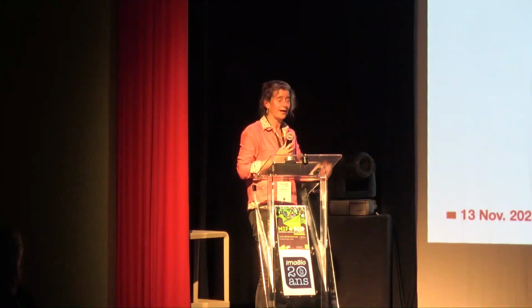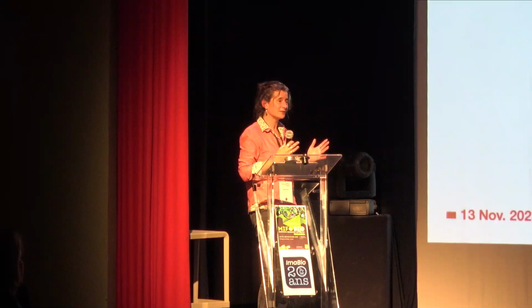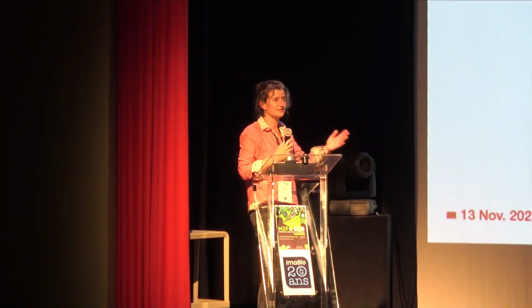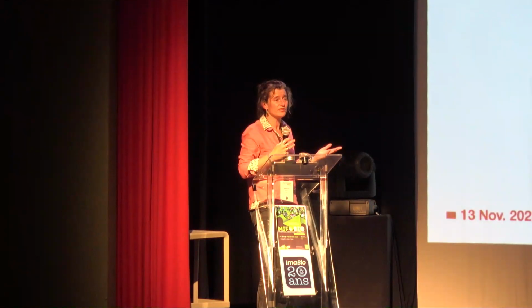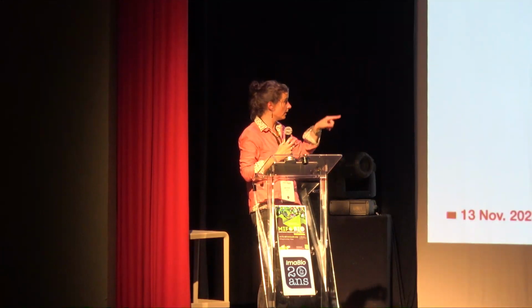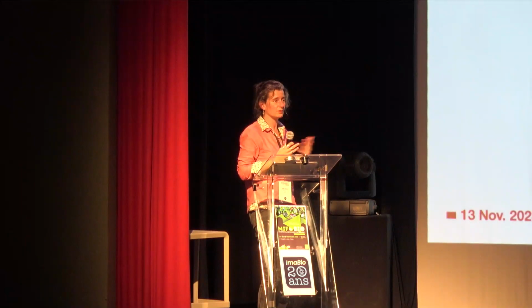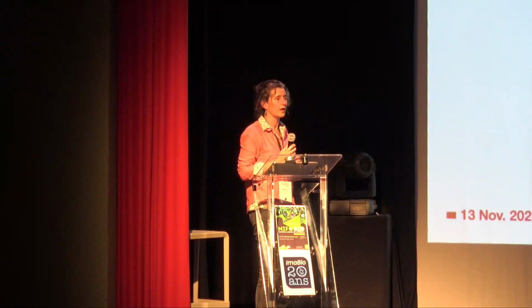So actually in the lab we developed what we called an incubascope, which is a very basic microscope that permits us to follow the organoids developing for weeks. That is very cheap, and it depends on the readout. We were interested in monitoring the shape and making segmentation of them, and for that application it's enough. So really the technique depends on what the readout is and what information you have to extract, and I think that's the very first start of the experiment.